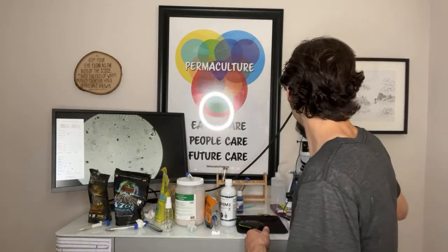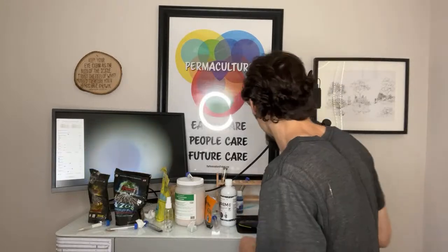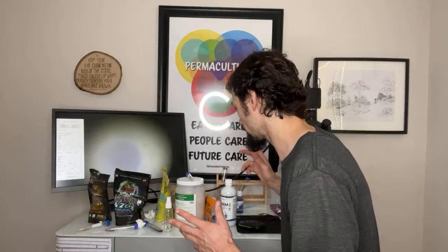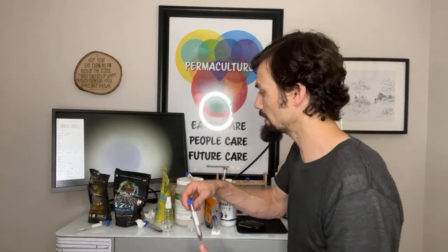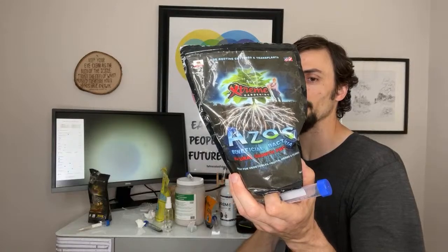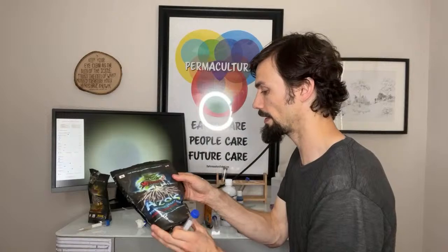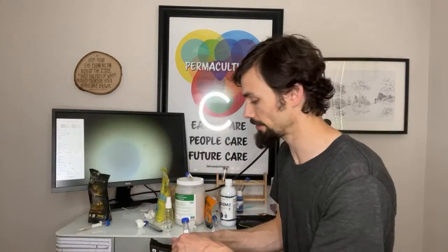All right, so I put this back to 40x. I'm going to set that aside and let's do something else. Let's do something like opposite. So this is the azos. This is a rhizobacteria and it's Azospirillum brasilense. And then, of course, it says inert carrier, 99.9%. So let's see what that inert carrier is, right?